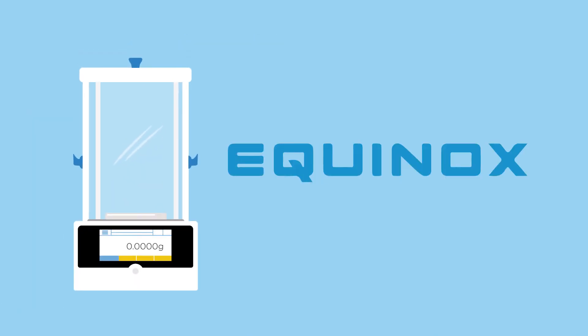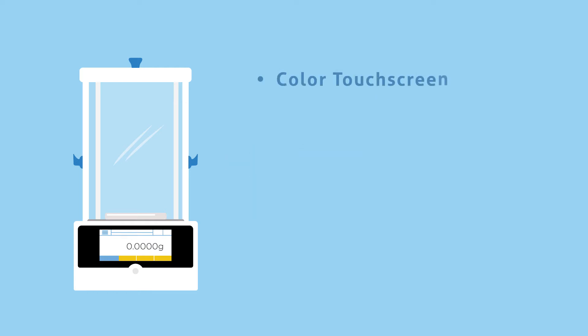Offering superb precision, Equinox is Atom's most advanced balance line to date. Equinox offers a color touchscreen display with icon-driven menus and readily accessible applications and functions. Its 5-inch screen is generously sized with 800 x 480 pixel resolution for excellent visibility. Customize the display by choosing one of five color presets to change the appearance of the buttons.